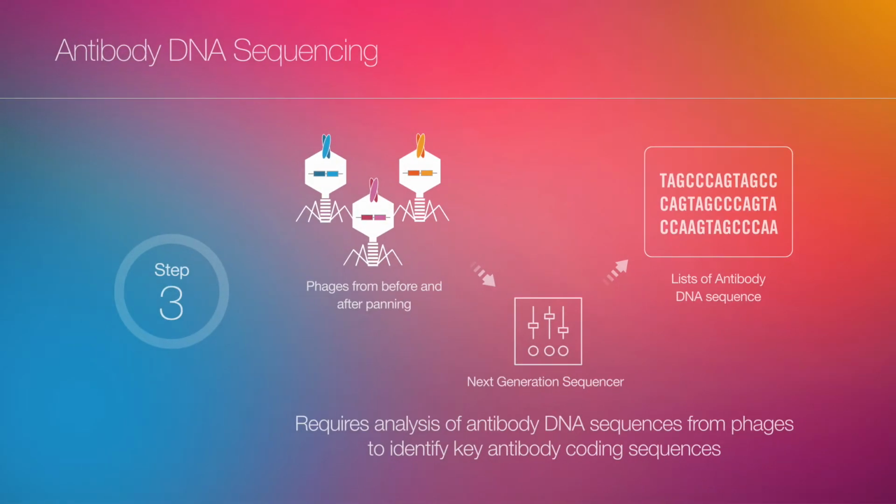In step three, we perform antibody DNA sequencing. Here we sequence the phages before screening and after just one round of screening, so the experimental bias is reduced, and we use high-throughput next-generation sequencing to identify key antibody coding sequences.